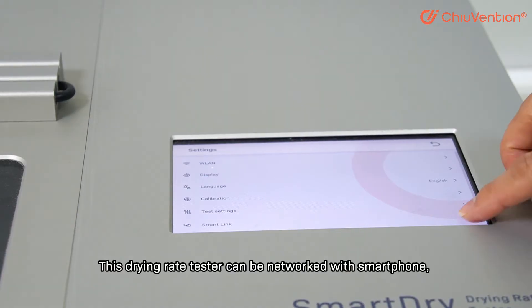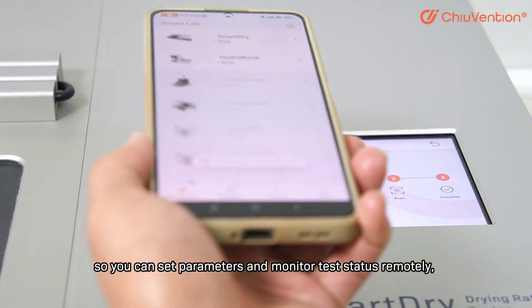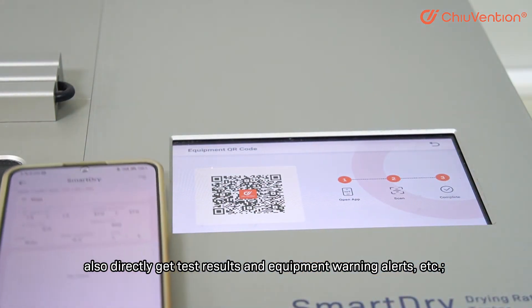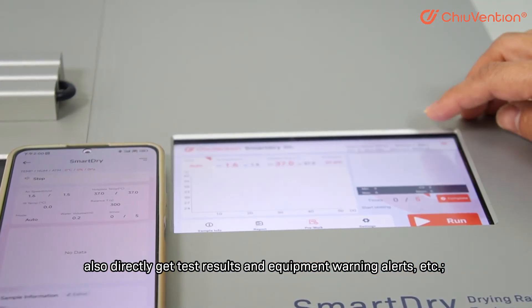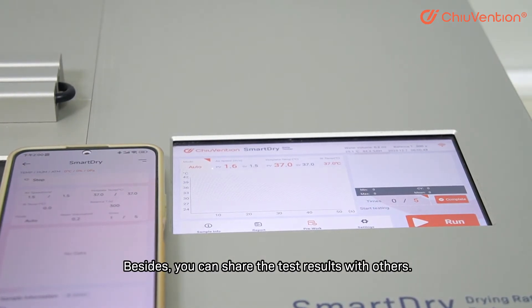This drying rate tester can be networked with a smartphone, so you can set parameters and monitor test status remotely. You can also directly get test results and equipment warning alerts, and share the test results with others.